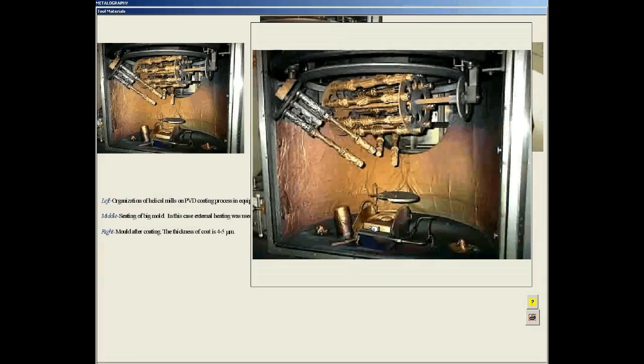Against the cathode is the anode made from a copper block, and in the center is the titanium cubicle. The top of the anode is covered by a blind. After the starter arc, argon forced through the hollow cathode is ionized, and heavy ions of argon bombard the surface, but also the whole chamber. Between the chamber and the anode is an electric potential, so the ions of argon are accelerated. By this process, tools are cleaned as well as heated.